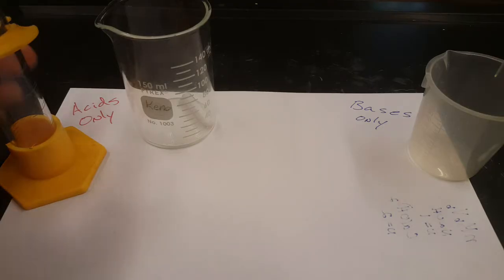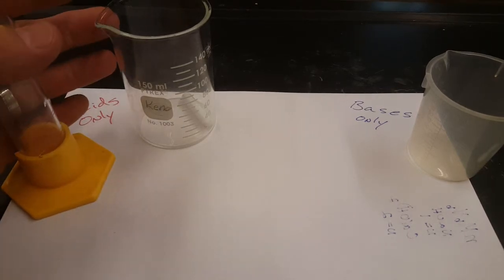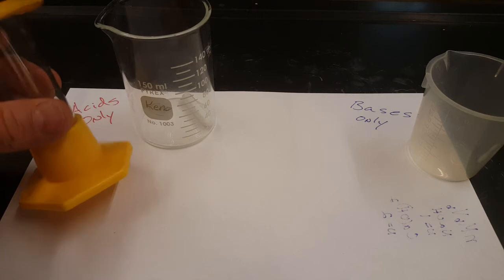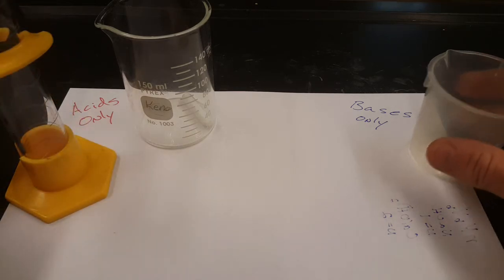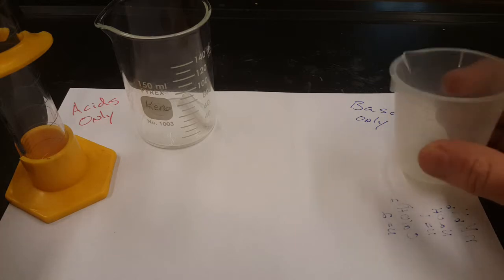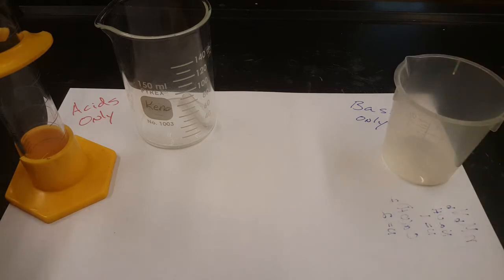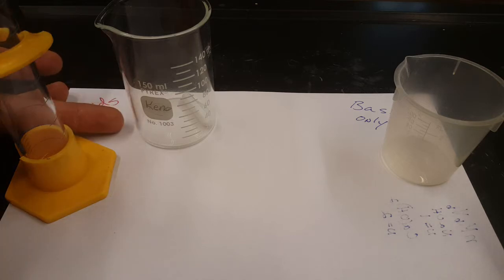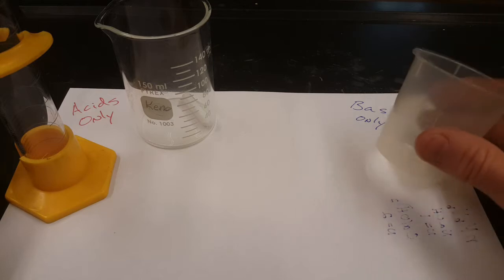Please make a note that your graduated cylinder and your beaker are for the acids. You're only going to use these for your acids. And the urinalysis cup is going to be for your sodium hydroxide. You'll either be assigned hydrochloric acid or sulfuric acid today for your acid, or both if we have enough time. And your base is going to be sodium hydroxide.